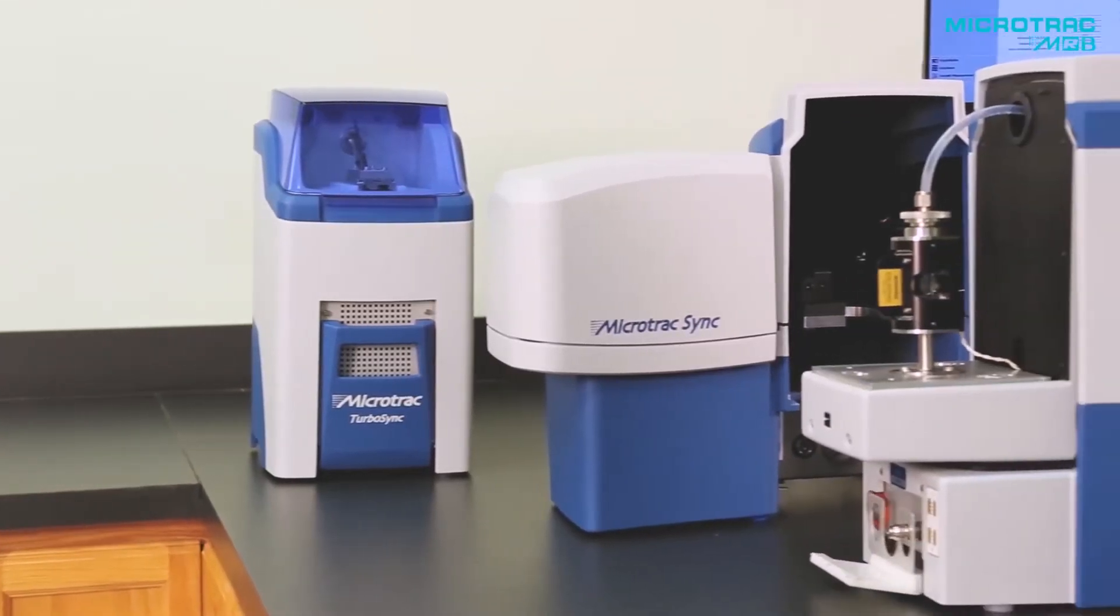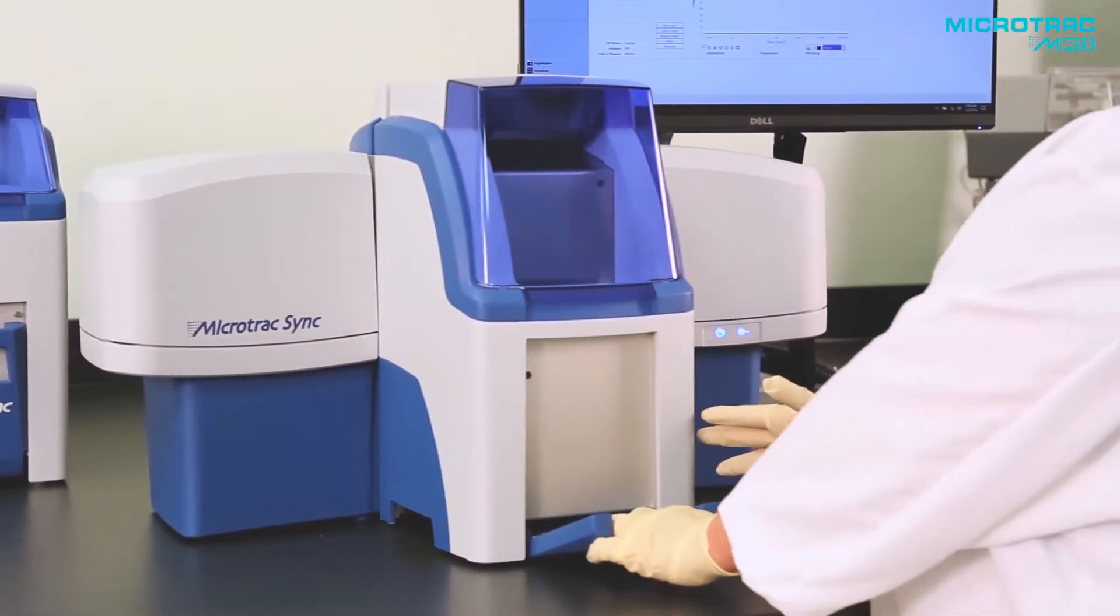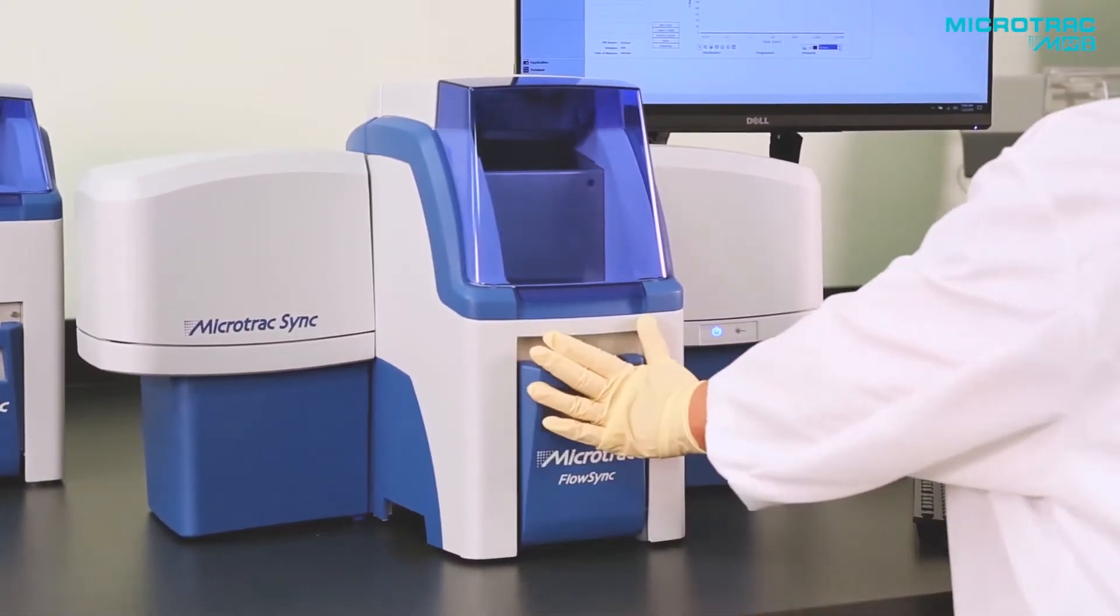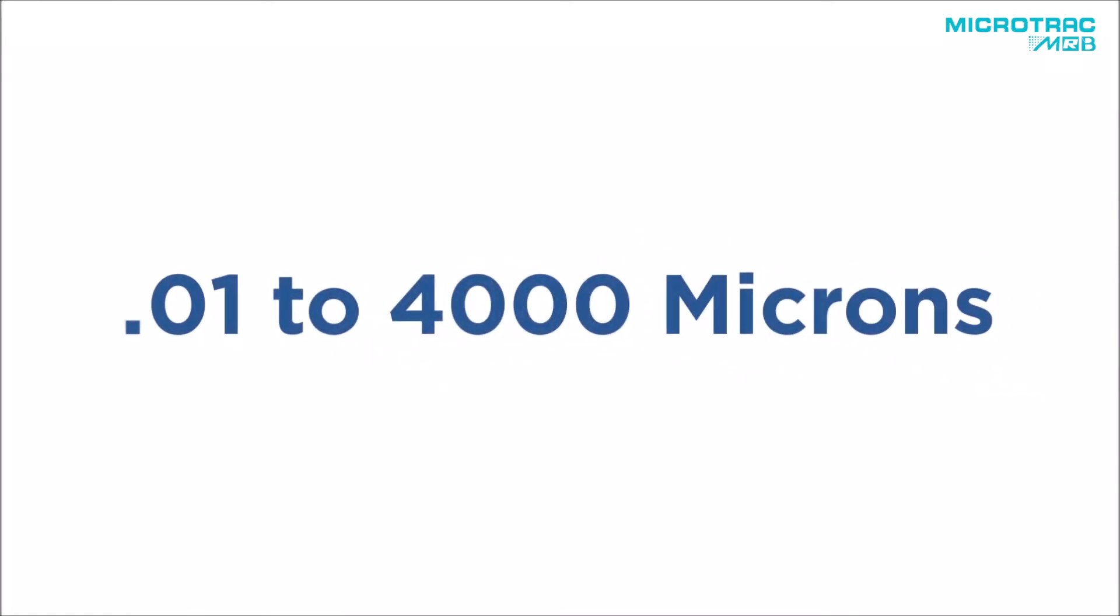Microtrack Sync, our synchronous size and shape analyzer, delivers that paradigm shift over a size range from 0.01 microns to 4,000 microns.